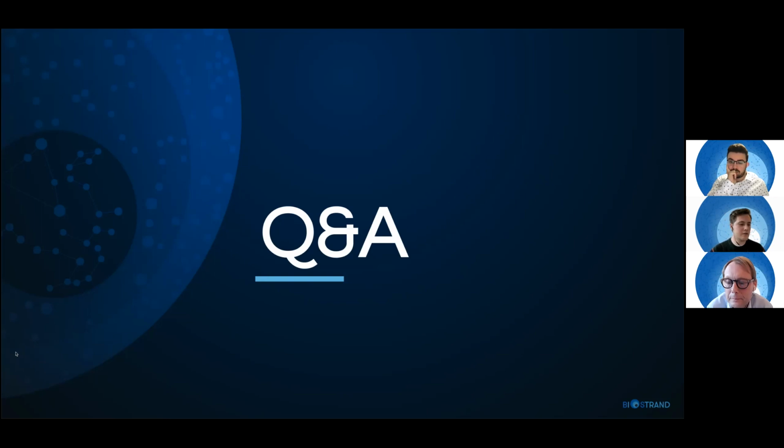Yes, thank you. And that brings me to another related question. I think this one is aimed more towards Sébastien. We've shown examples where we started off from an experiment, a sequence. Could you also do the same with any predefined set of genes that is not strictly related to any experimental data outcome, but would be a certain group of interest that you want to analyze and check?